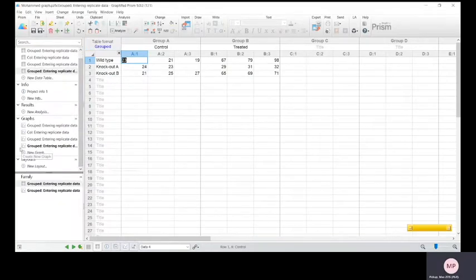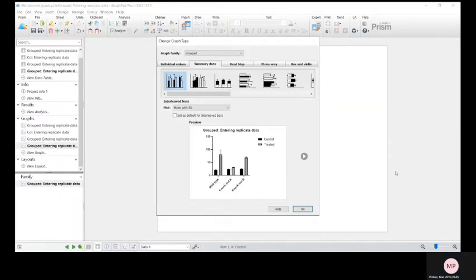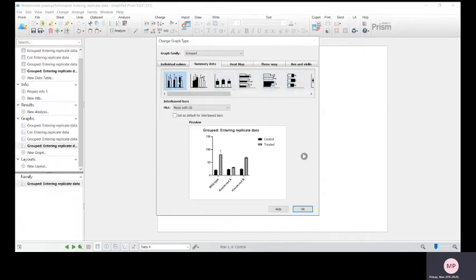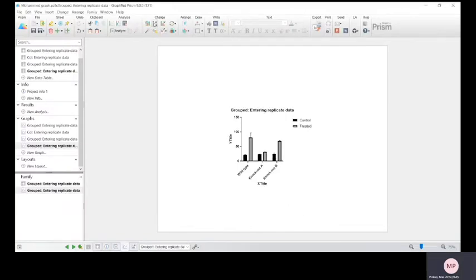If we open that, you can change the type of graph you want as well. This one's pretty standard for what we use. Just make it a bit bigger.